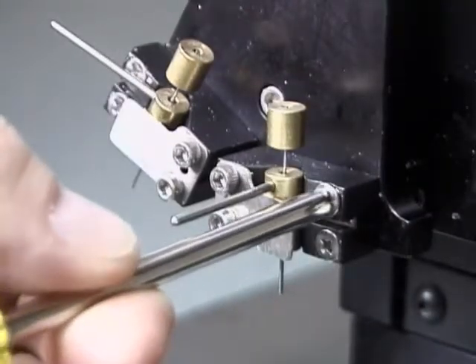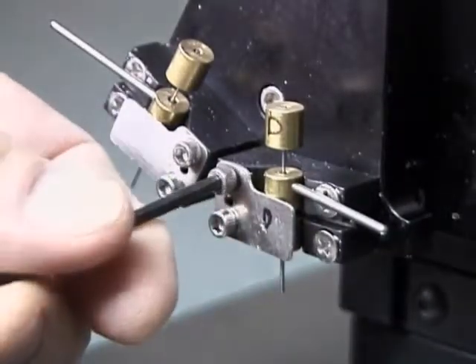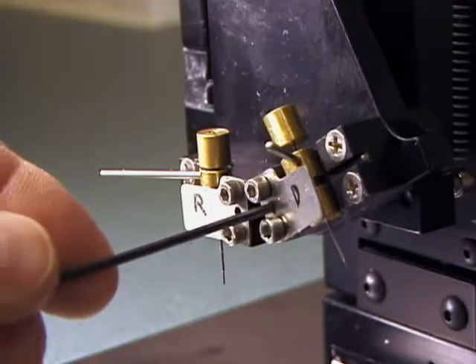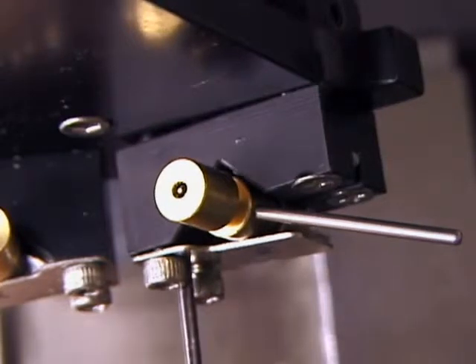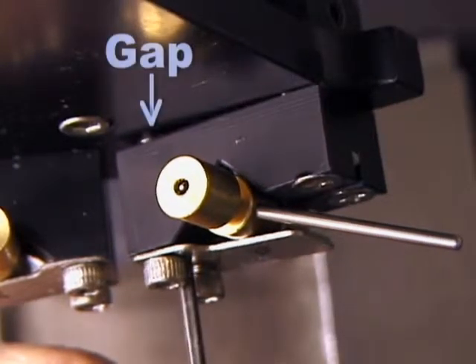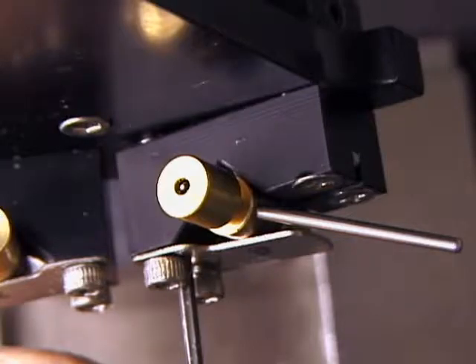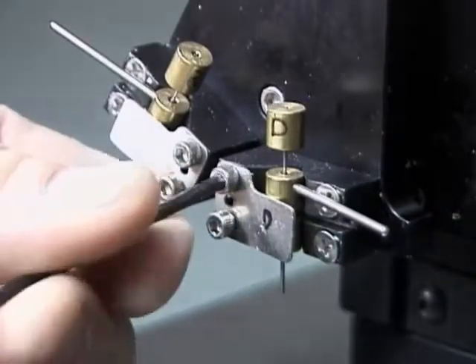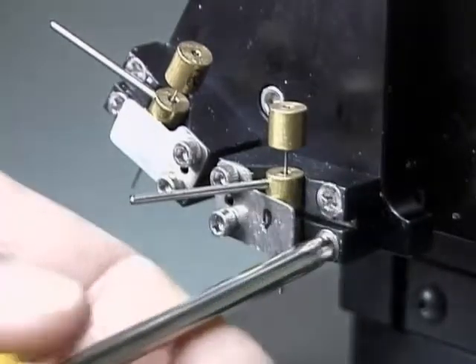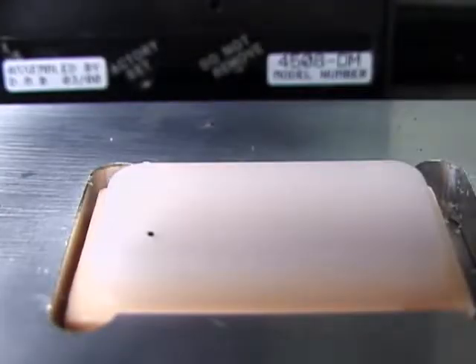Before turning the needle adjustment screws, first loosen the two Phillips screws. This loosens the needle assembly so the needles can be adjusted. With the proper hex wrench, turn the small screw located between the needle screws. This adjustment moves the entire needle assembly away from the turret. After the needles are adjusted, remember to tighten all screws before punching. To test how well your adjustments went, place the test punch into the recipient hole.